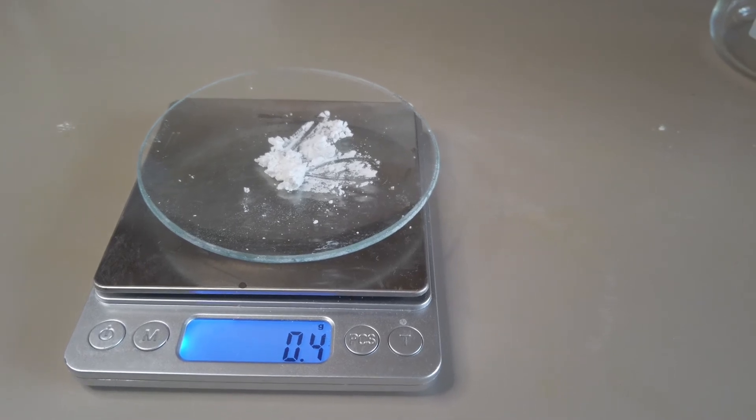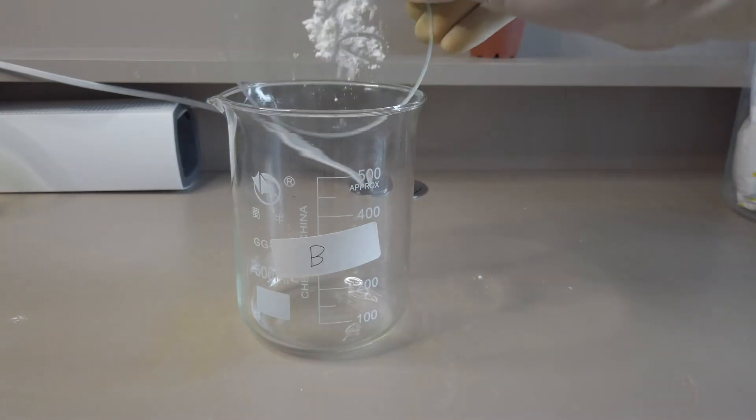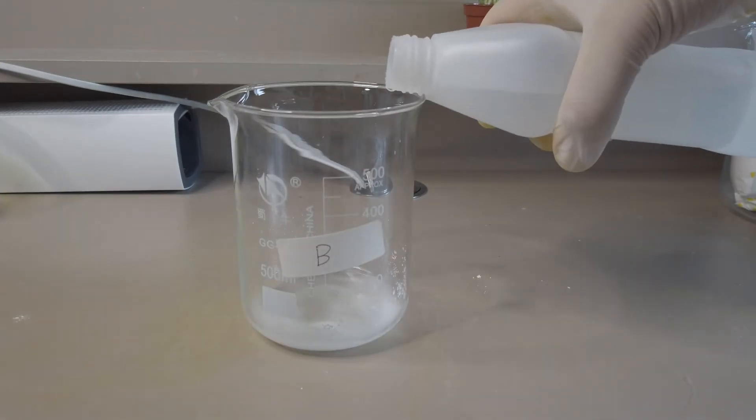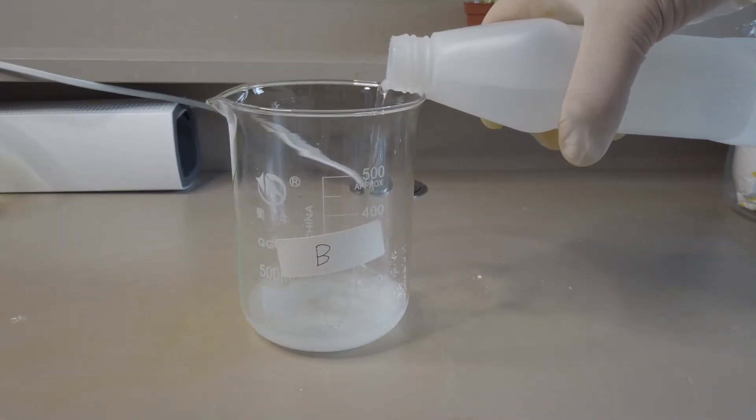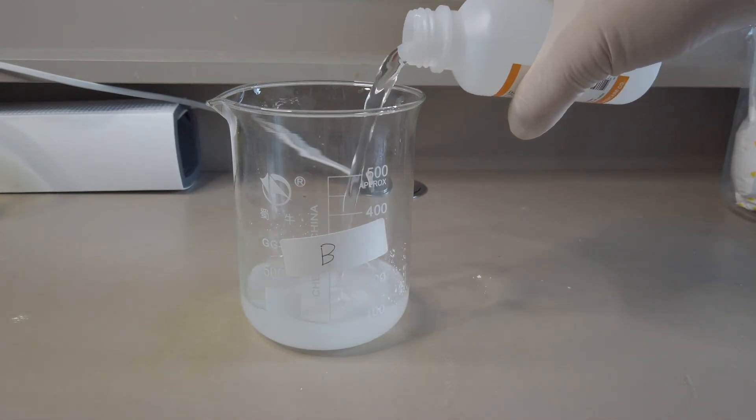We then measured out 0.4 grams of cornstarch and added it into another beaker. It was then followed by 60 milliliters of distilled water and 100 milliliters of 6% hydrogen peroxide.